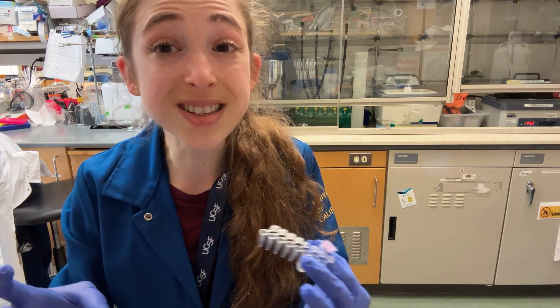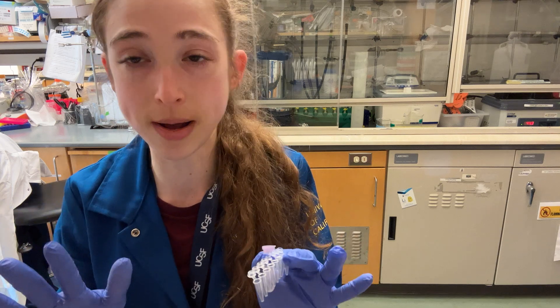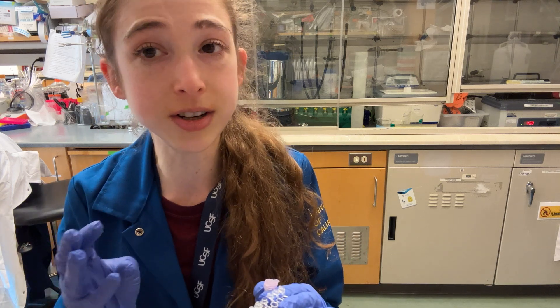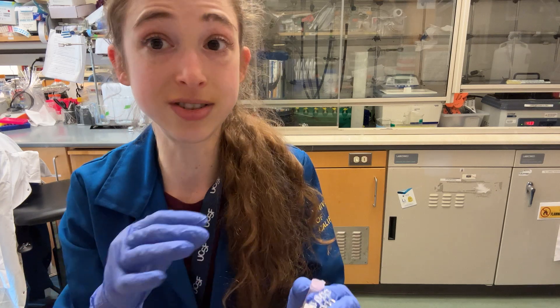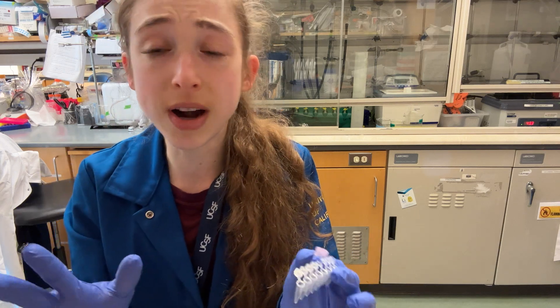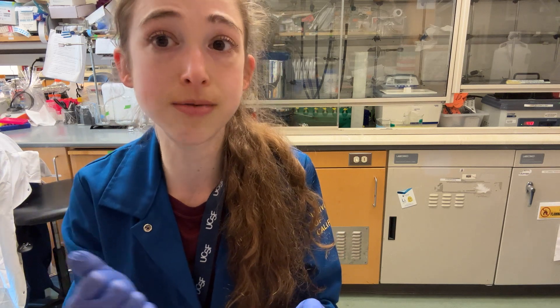Basically there are things you can do to optimize your PCR reaction to increase your yield as well as your specificity — and I care more about the specificity than the yield. So once I optimize that 50 microliter reaction so that I get one single band on my gel with no smears and no non-specific products, it might not be as bright a band as I want, but I'll just pool multiple reactions together rather than keep trying to optimize and risk reducing the specificity.